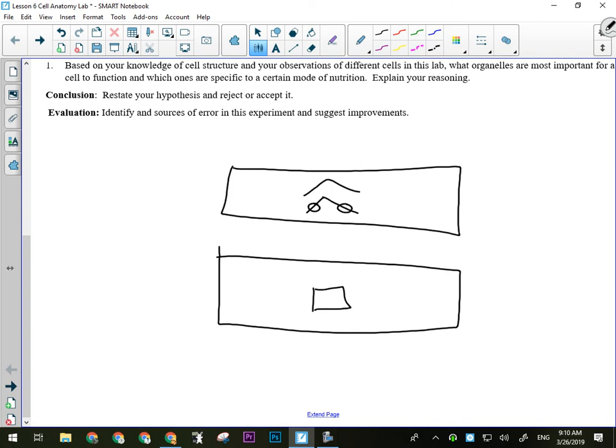If you can see the outside of a cell, you can see its membrane. If you can see where the cell begins and ends, that's the membrane. If you can see the nucleus, then you can see the nuclear membrane because you can see where it starts and ends. You should be able to see nucleolus, probably rough ER, lysosomes, chloroplasts. If you're really good, you might even see mitochondria. Occasionally, I have had people see Golgi apparatus. You will not see smooth ER, it's completely transparent. You won't see ribosomes, they're too small. But you should be able to see the majority of the major structures.